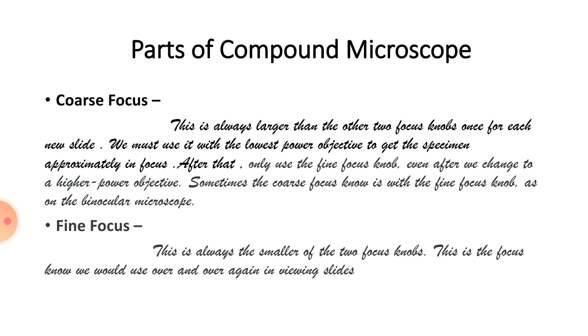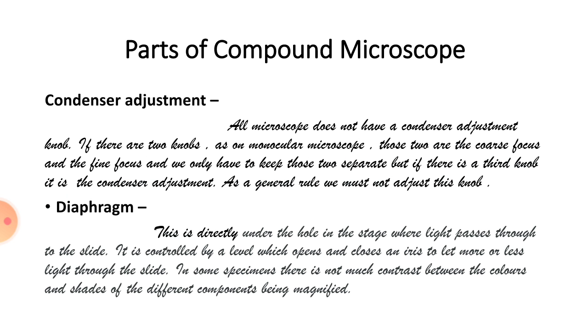Next is fine focus. This is always the smaller of the two focus knobs. This is the focus knob we would use over and over again in viewing slides.